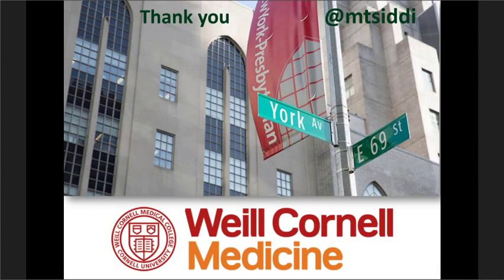Yes. Because remember, the GI service operates on its own schedule for a variety of reasons. They may be doing these procedures and they may find incidental pancreatic cysts, which they were not in there necessarily to detect or diagnose, but then they see them and they end up aspirating them at all hours when our service may not be available. Then for these small cysts, they just aspirate them and send them to us in Cytolyt. And we prepare a ThinPrep slide, and if there's more material, then definitely a cell block can be attempted on it.